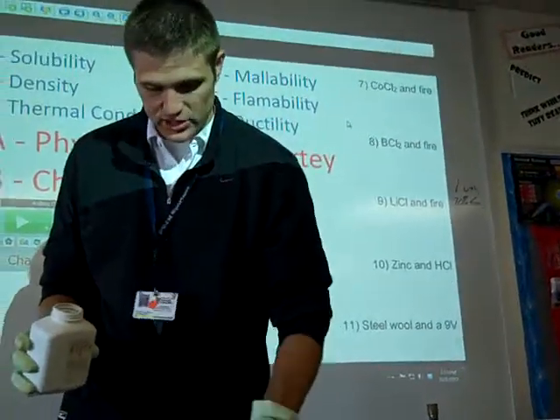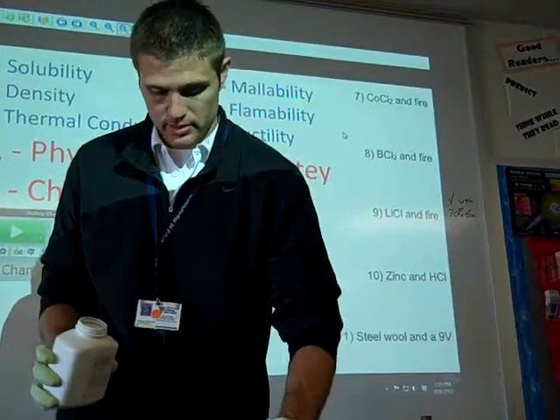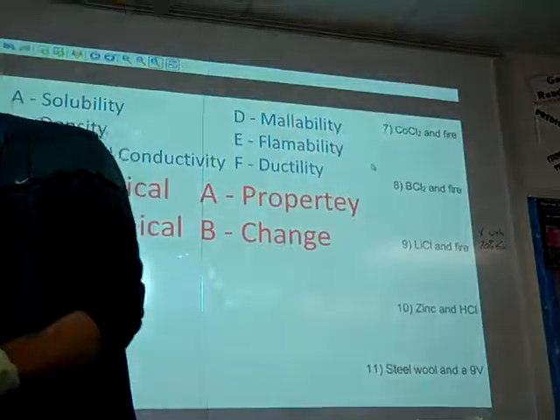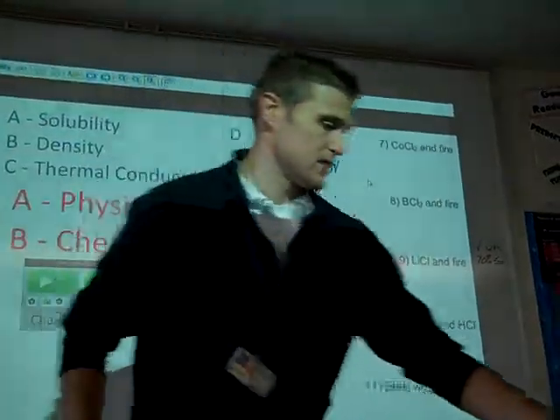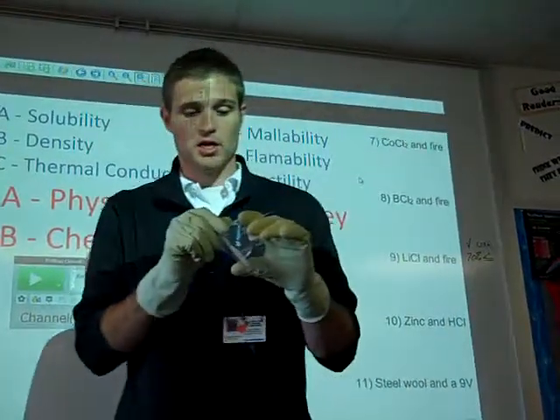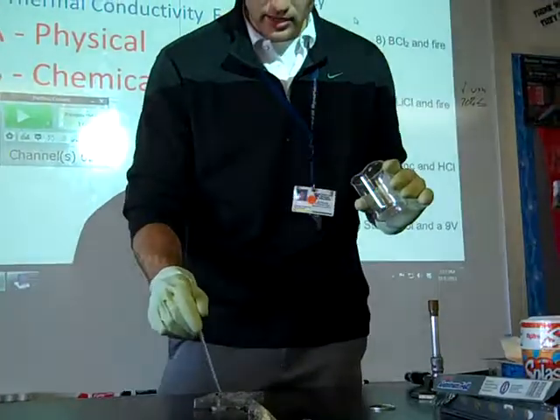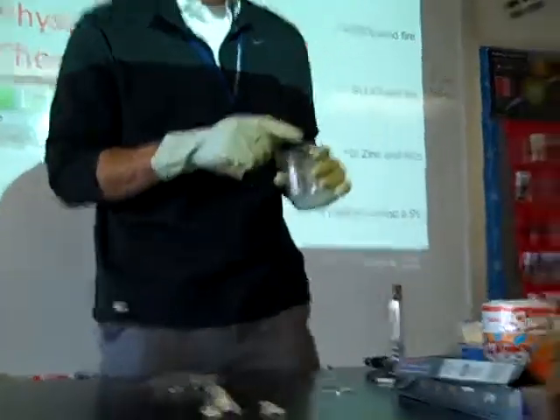This is just zinc, which is just a metal. Like you find it in the ocean. Yeah, you can find it all over the place. So zinc's not bad. What is bad is this. This is the hydrochloric acid. Okay, so it looks clear and things like that. It doesn't eat through glass, which is nice, or plastic. Okay. So Angela, if you want. Whoa! Okay. You have a little closer.